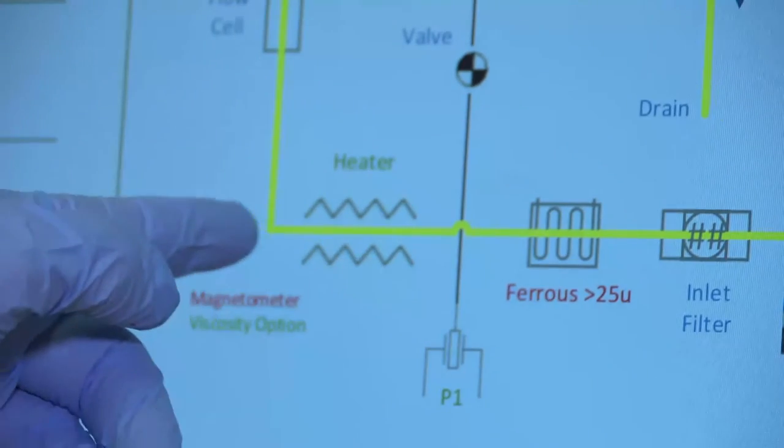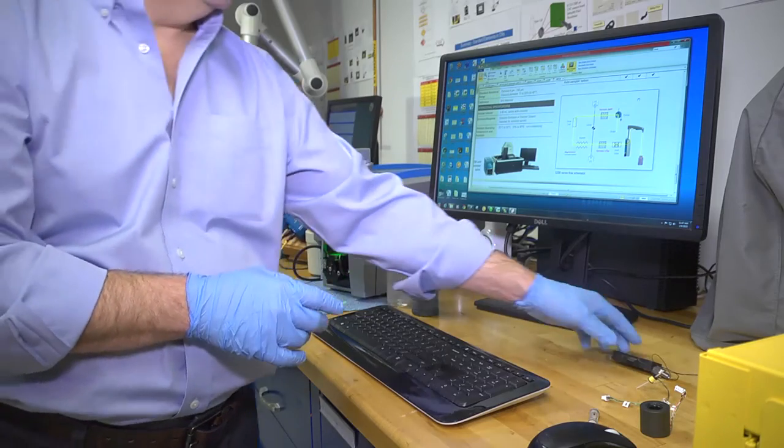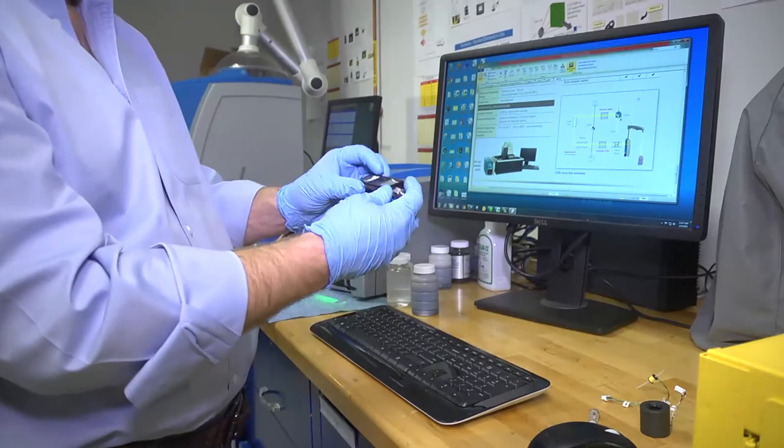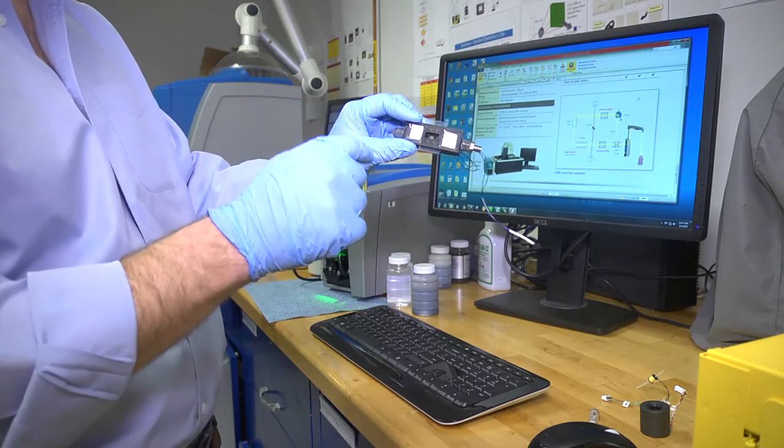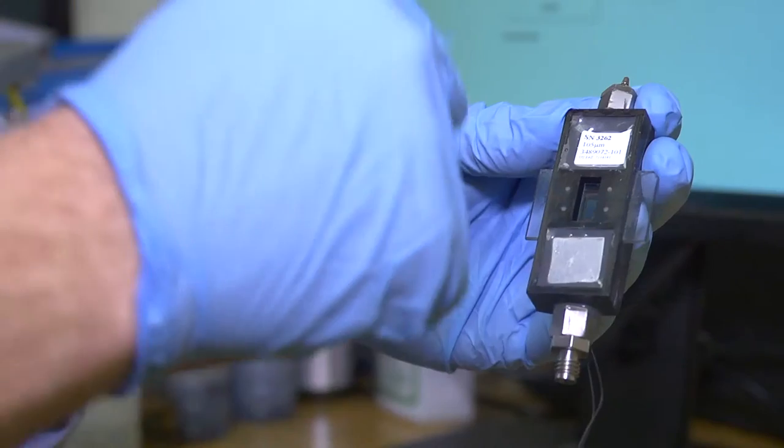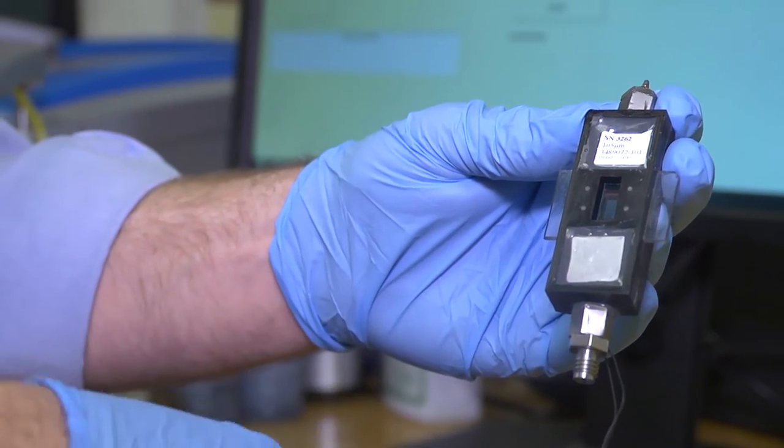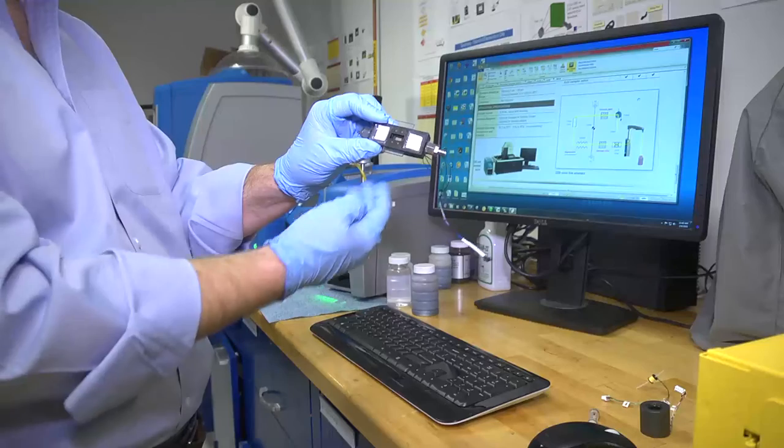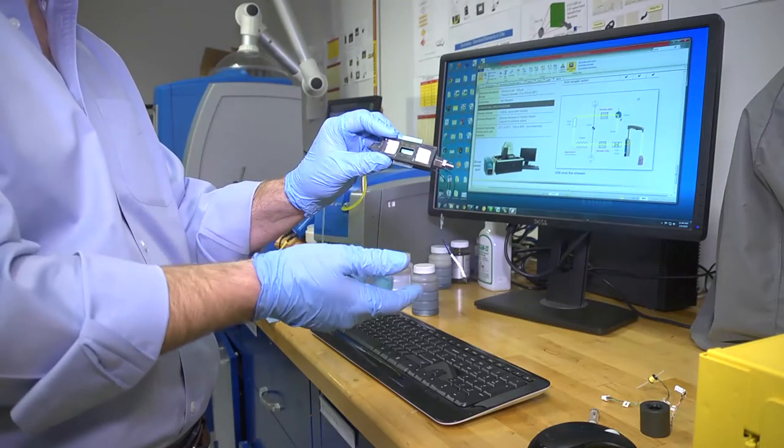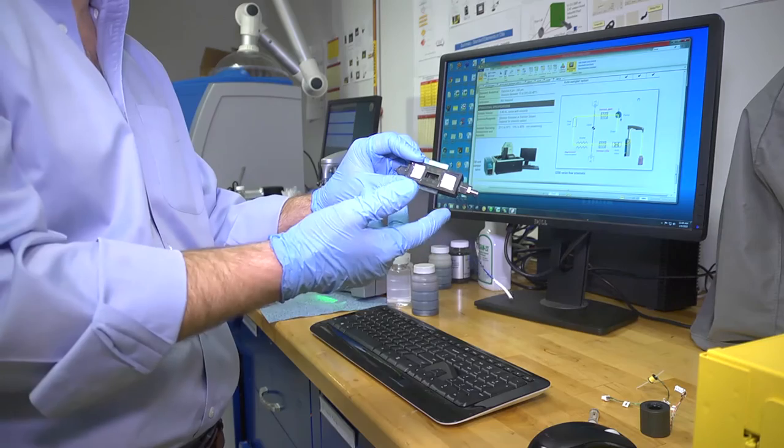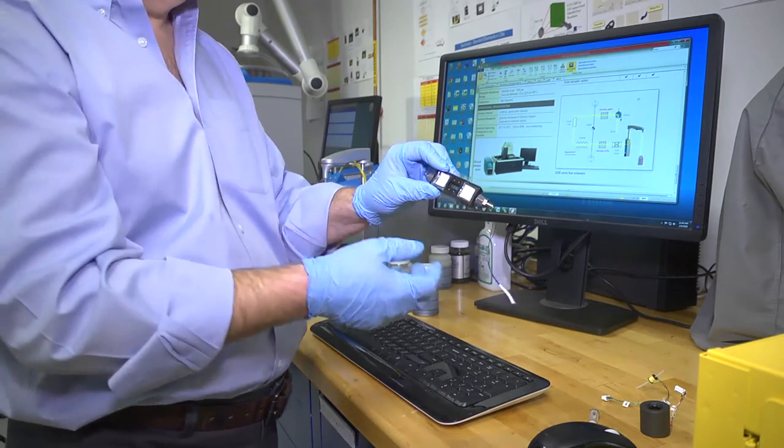Then as the sample continues to flow, it goes into the flow cell. The LNF flow cell provides laser-generated light that passes through the sample itself and then is imaged on the rear panel where there's a CCD detector. Just like a digital camera, it records and images each individual particle.